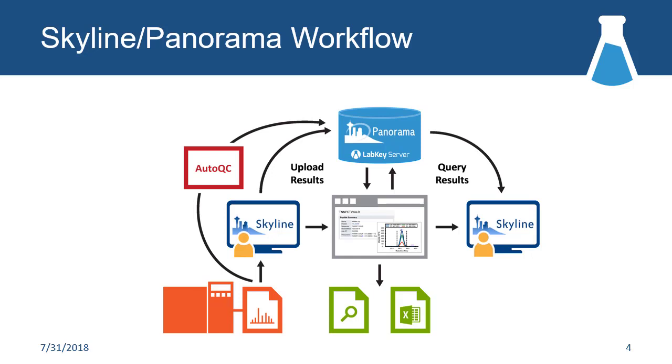In our little diagram here, over here, we've got the instrument generating our data, producing raw files of various formats, slurping those into Skyline, and then uploading that into the Panorama web server up here.